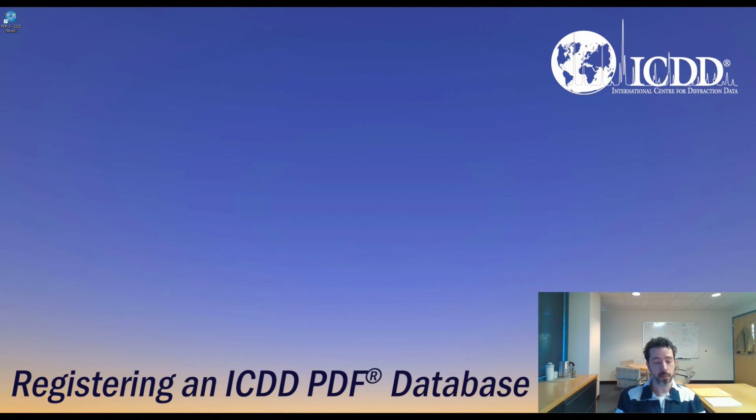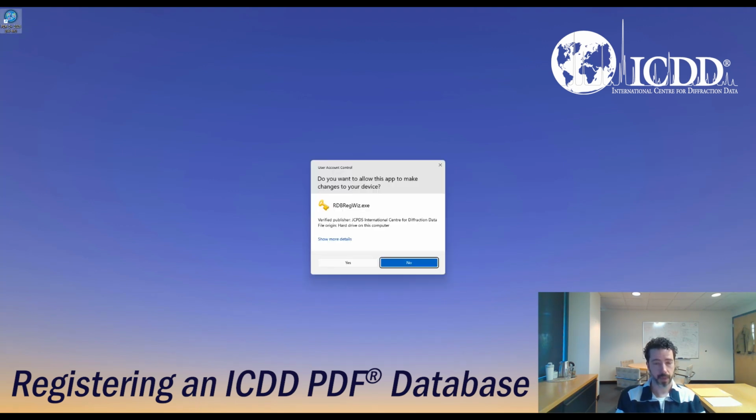To begin, we want to open the PDF database that we want to register. In this video, we're going to register the PDF5 Plus 2026 database. So to do that, we're going to double click on the PDF5 Plus 2026 icon on the desktop. Because this registration program does modify the license file, it will prompt you, do you want to allow this app to make changes to your device? So simply click Yes.